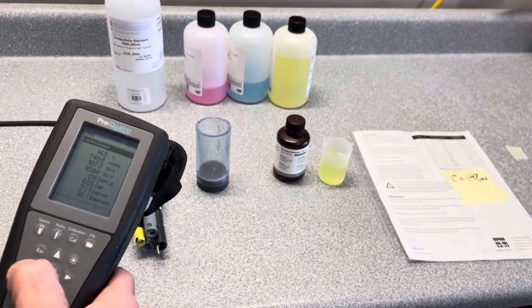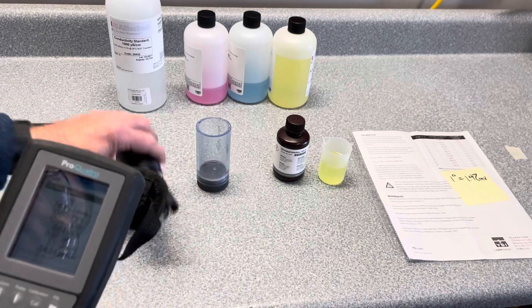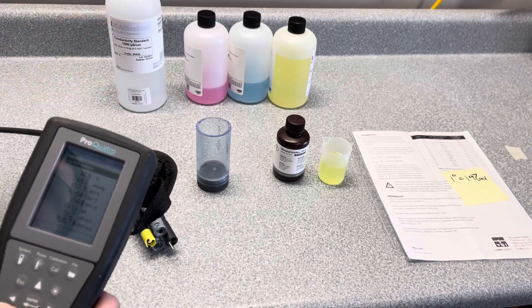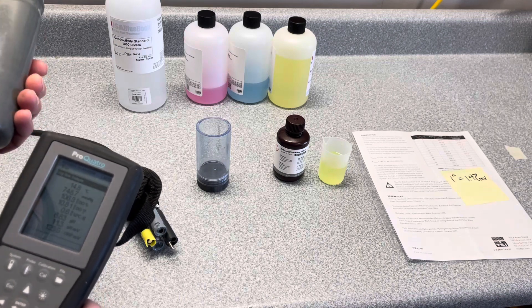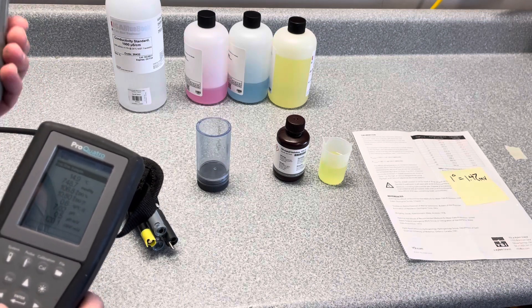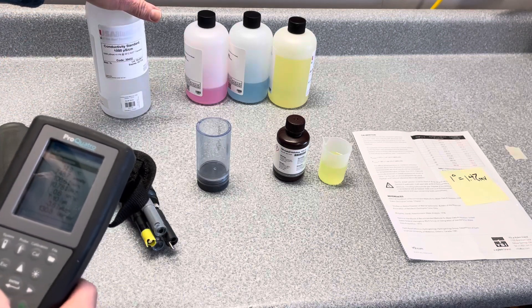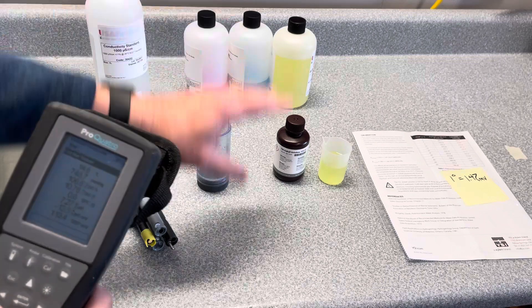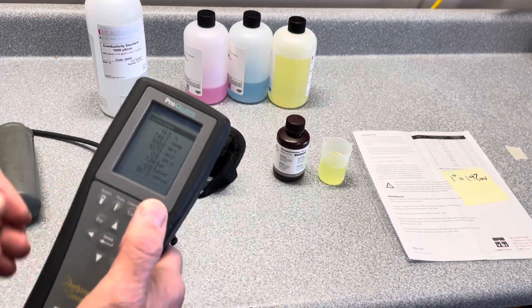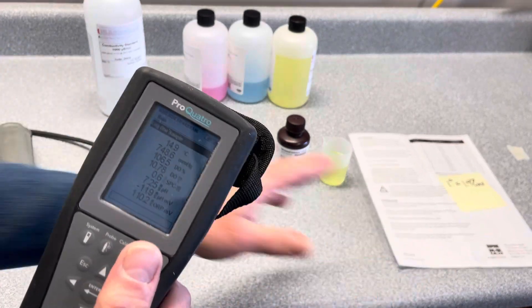You're also going to need calibration solutions. For what we have on this cable, we're going to use the moisture environment for the DO, conductivity standard for the conductivity, pH buffers for pH, and Zobel solution for doing the ORP, along with the instruction manual.